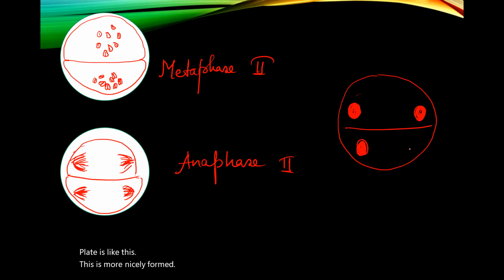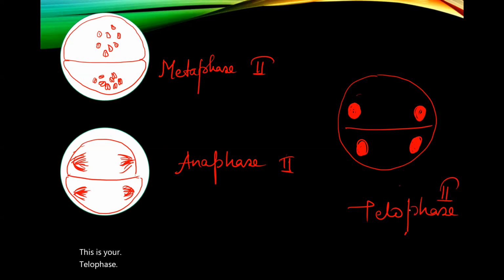Like this and like this. This is your telophase 2. Okay. So this is something that you are going to see if you carefully study these stages under the microscope. Try to identify them by recalling the key characters that I have told you.